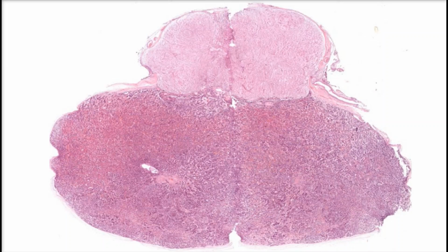The focus of today's lab will be on 6 endocrine tissues: the pituitary gland, thyroid, parathyroid, pancreas, testes, and ovaries. Keep in mind that several of these glands are also part of other organ systems and have additional functions. For example, the pancreas produces digestive enzymes, while the testes and ovaries produce gametes in the reproductive system.